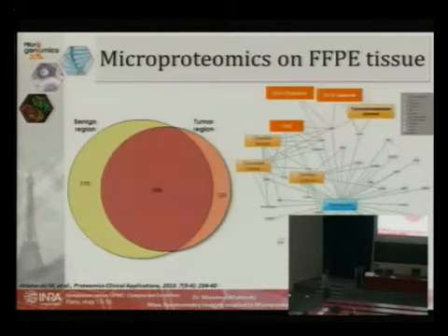And we obtained a list of 123 proteins specific to the tumor regions, and by realizing some data mining using gene ontology, we show that a lot of them are involved in a neoplasia process, and there is also a large part already known to be involved in urogynecological disease and also in ovary cancer.